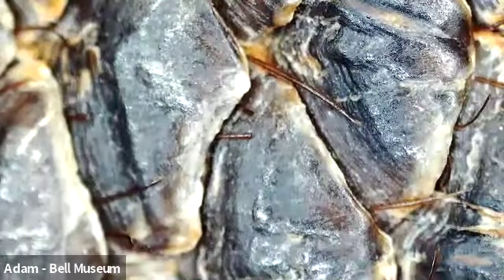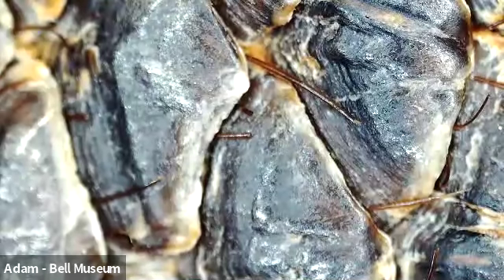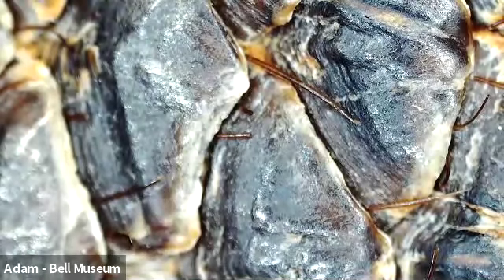Okay, let me just get it in focus here. So the first clue I have for you is this organism secretes an oil called Castorium that has been used in perfumes and as a food additive. So go ahead and write any guesses you have in the comments, and we'll give you a few seconds to do that before I zoom out.